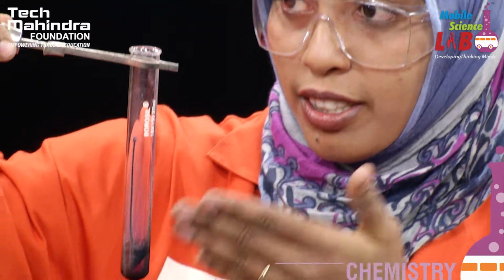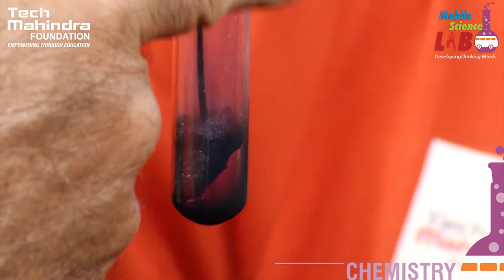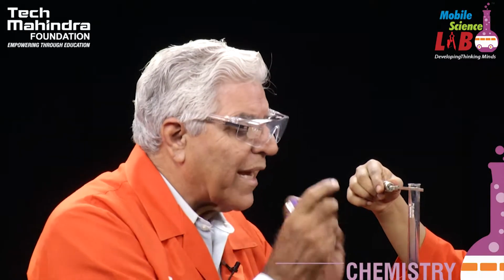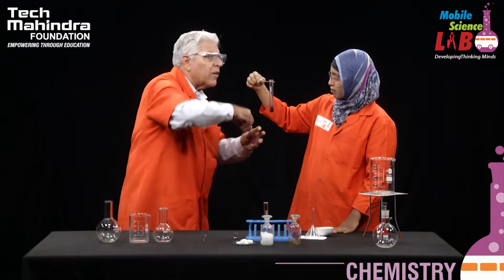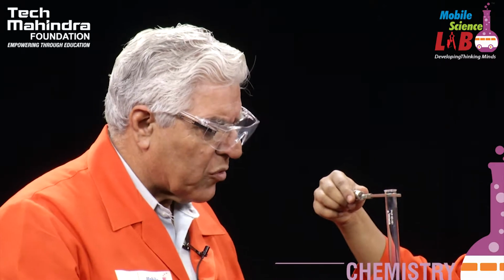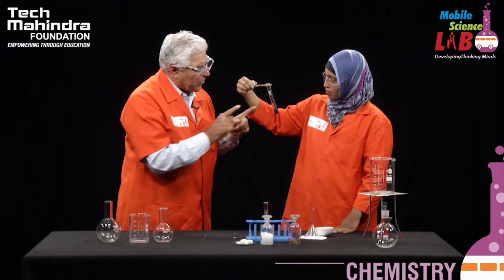Can you see that? The moment we have heated, it turns from solid to vapor, gas, and when it is cooled down, it turns to solid again. When the vapor rises up on the sides of the test tube, this is cold compared to the bottom. So again it recrystallizes. This way we can go on doing it over and over again. If I heat it very strongly, we will have violet vapors coming out. I don't want to have that much iodine vapor, but it is very clear that you can see the crystals of iodine sublimed over there.